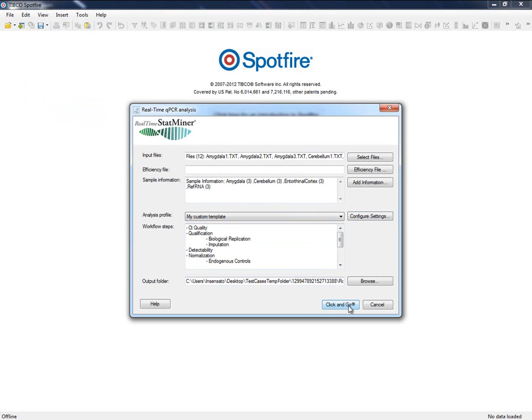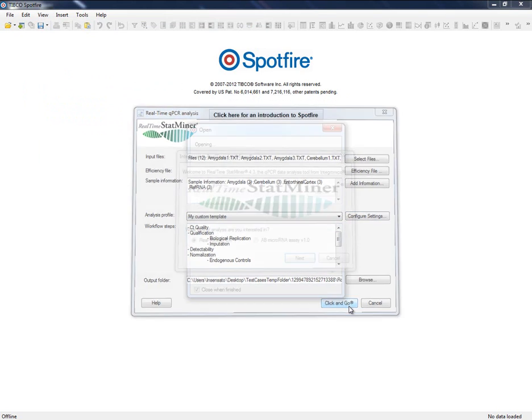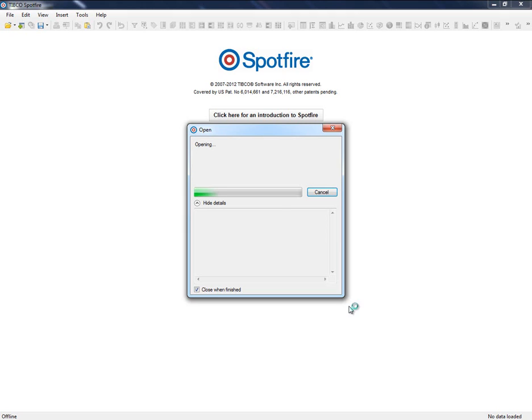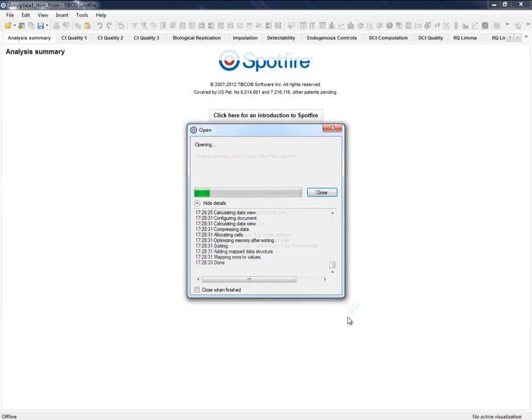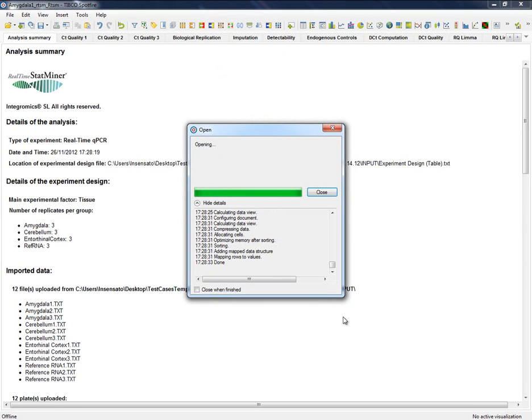Click and go execution will perform entire analysis in an automatic way, relying on the settings that we have just defined. Once finished, StatMiner will display the result of the analysis organized by tabs.